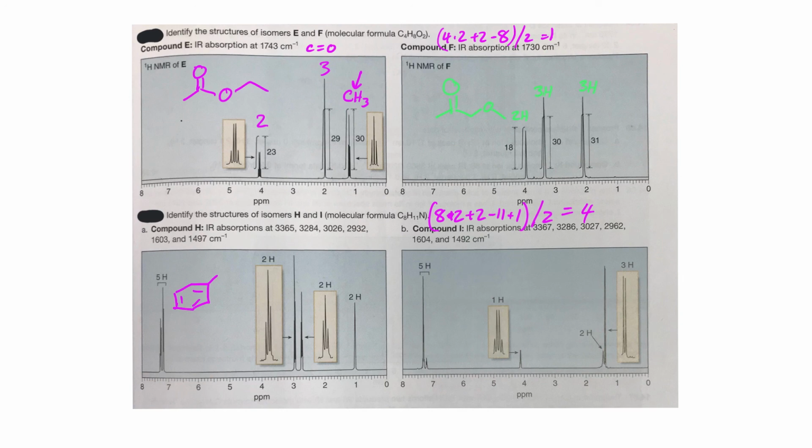We know that we have a set of CH2 groups, so I like to think about that kind of like this, where X's are a group that does not have any hydrogens on it, and I shouldn't put that X up there because that group may have hydrogens, but I'll put a Y here. And then we have this group, which is most likely the NH2. Let's count our carbons and find out.